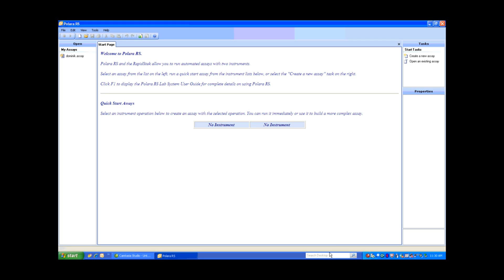Today I'm going to show you how to use the RapidStack with the WellWash Versa and Polara RS. Polara RS is the scheduling and control software that allows you to use the RapidStack with a number of instruments. Today we're going to look at the Versa. On the screen is the welcome page to Polara RS — this is what you'll see when you first open it up.